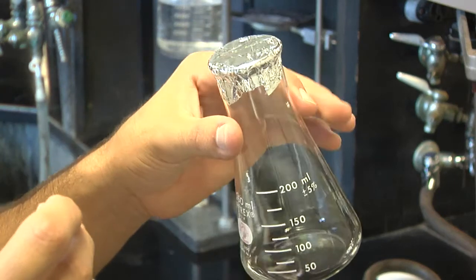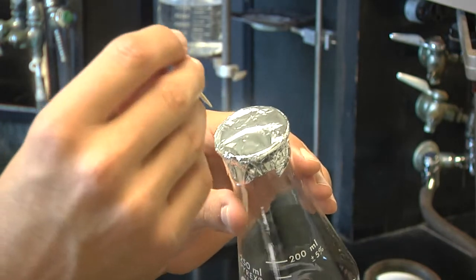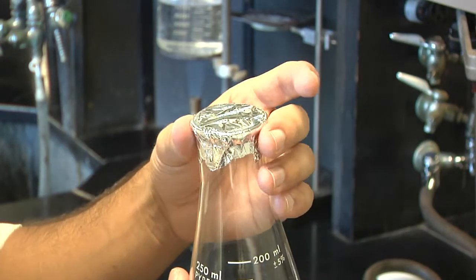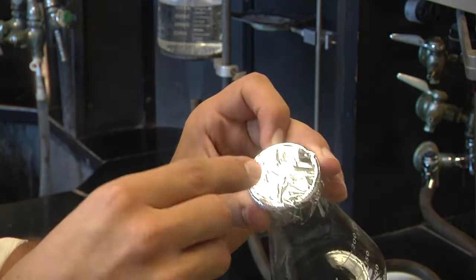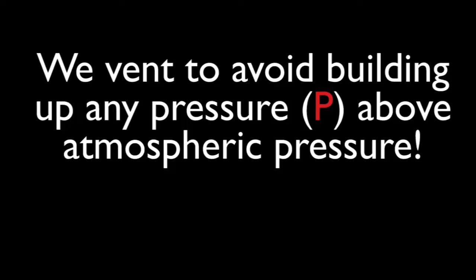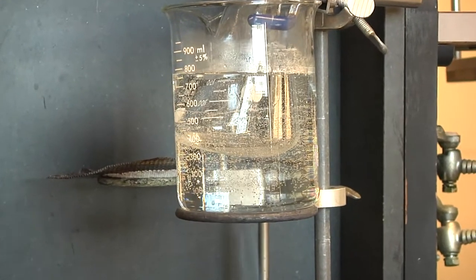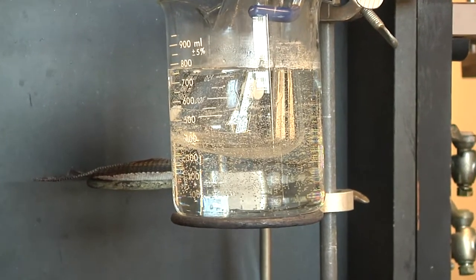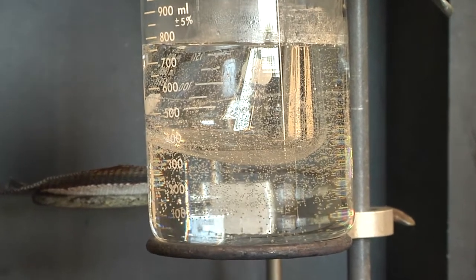Cover your volatile liquid with a little bit of aluminum foil in order to prevent excess evaporation of your liquid. Punch a small hole into the top of the aluminum foil to allow venting. It will be very difficult to observe your volatile liquid being completely removed, so I suggest tilting your Erlenmeyer flask on its side.